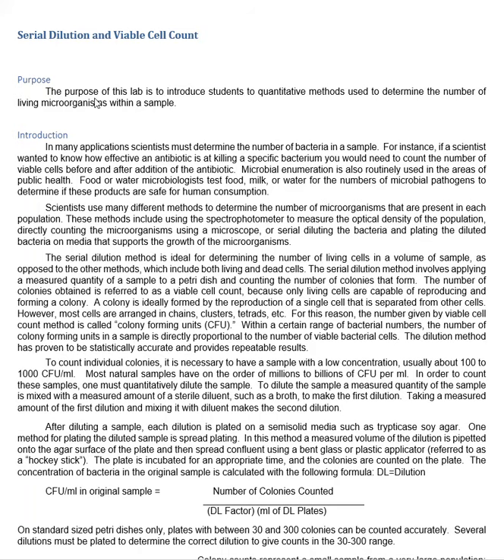We want to know how many living microorganisms there are. Now, we have talked about the spectrophotometer. You shine a light through a glass vial containing bacteria.